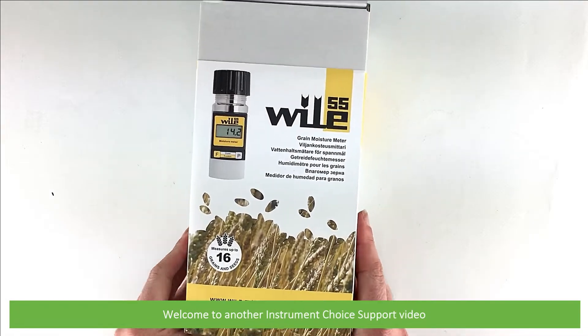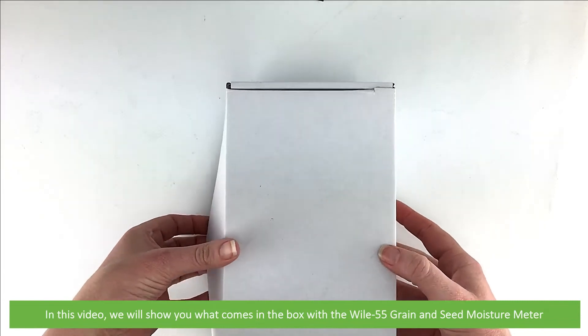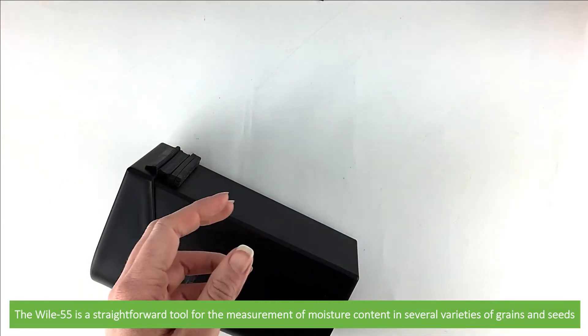Hi and welcome to another Instrument Choice support video. In this video we'll show you what comes in the box with the Wile-55 grain and seed moisture meter. The Wile-55 is a straightforward tool for the measurement of moisture content in several varieties of grains and seeds.